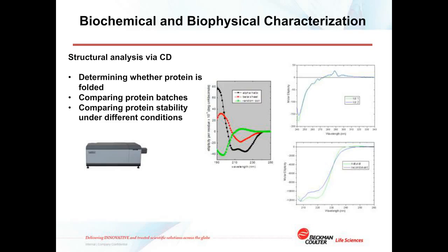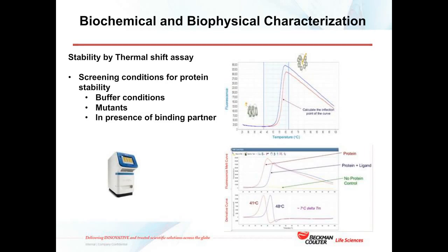the ability of the protein to absorb left and right polarized light, and the alpha helices, the beta sheets, etc., given their asymmetry, will absorb right and left-handed light in different manners. And if you compare batches of proteins in time, you will be able to see that they're either the same or different depending on their ability to rotate the light using circular dichroism.